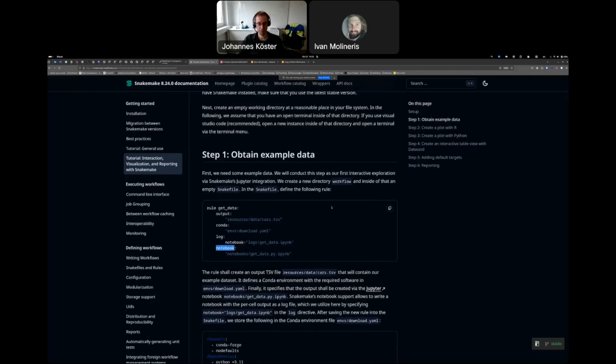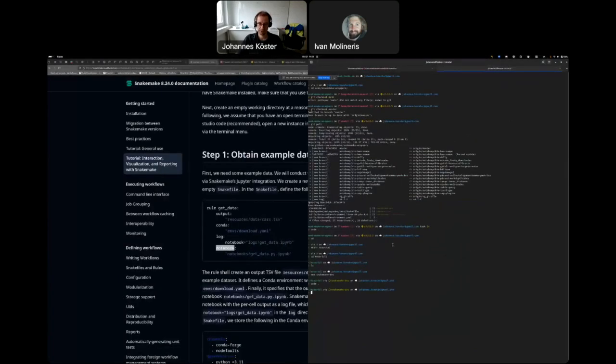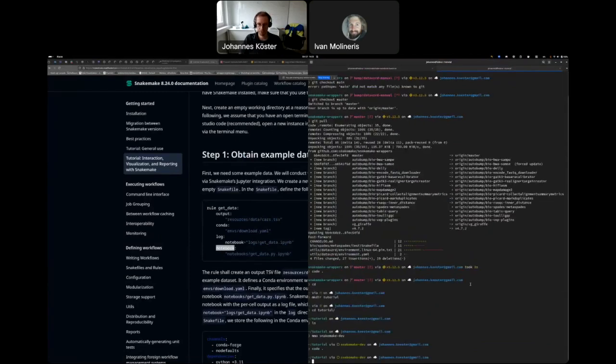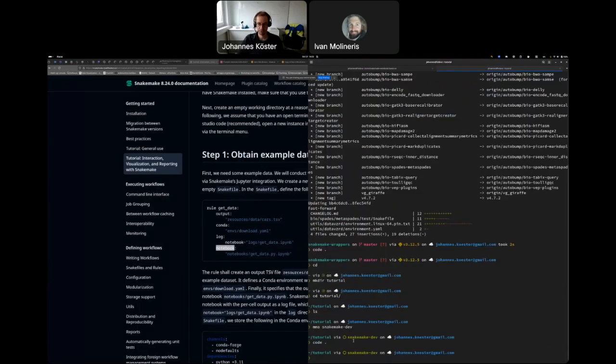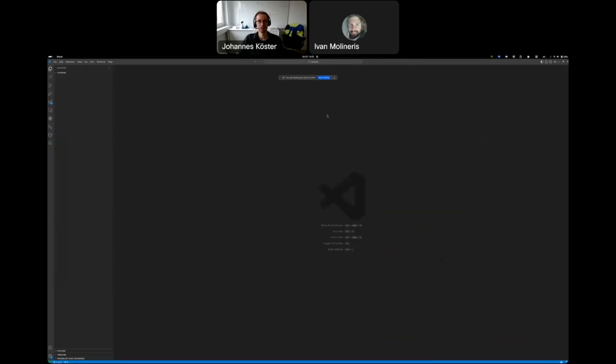So what I first do, as always when writing a Snakemake workflow, is of course to have an empty working directory. I've already prepared that, so I've just created this tutorial folder here. Let me also make this bigger. Tutorial folder here in my home directory, just for the purpose of this tutorial. And inside of that, I've now opened Visual Studio Code. Let me just open it now. Here we are. For now, it's all empty.